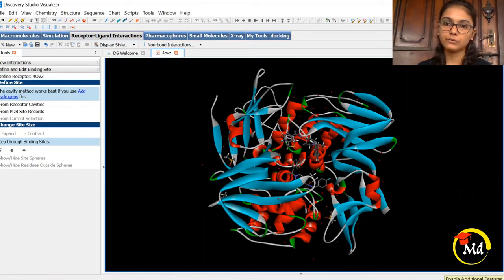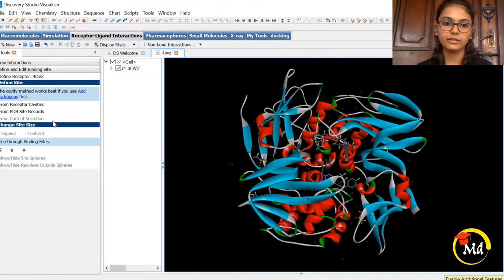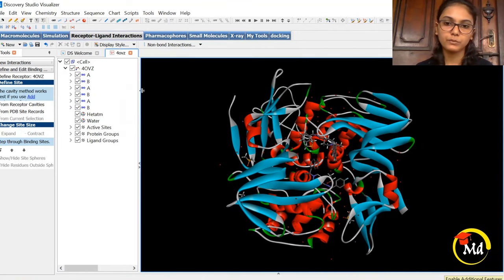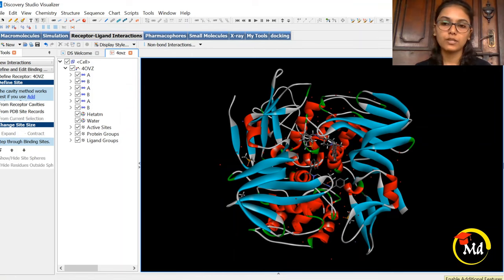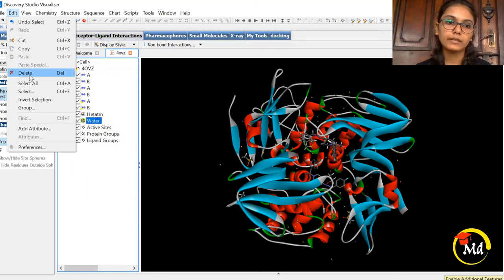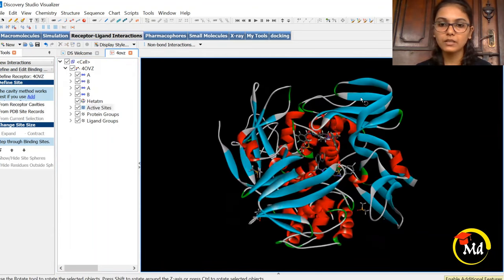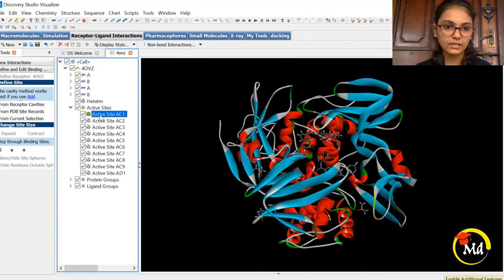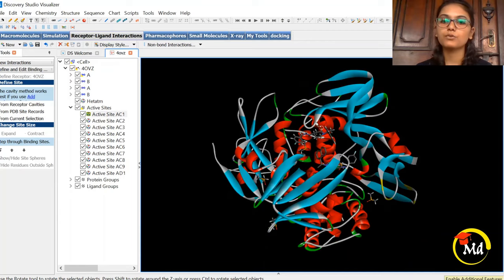Click on View and then Hierarchy. This will show you a protein tree which is very useful in protein preparation because we need to see the chains, water molecules, and other components. The first thing we will do is delete the water molecules present in the protein. Select water molecules, then Edit, and then Delete. All the water molecules have been deleted. There are also HET atoms, chain A, chain B, active sites — Biovia Discovery Studio is also helpful if you want to know the active sites in the protein.